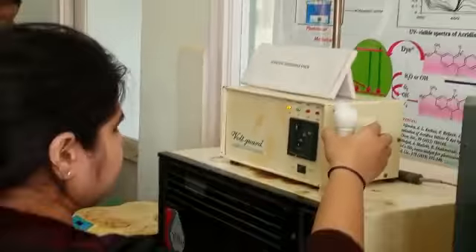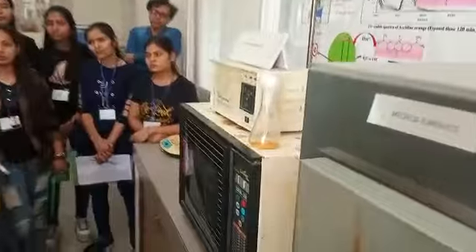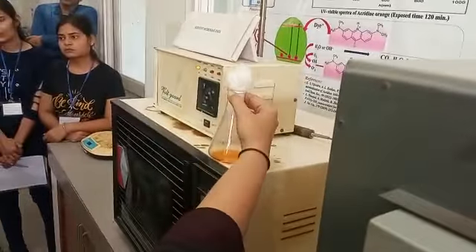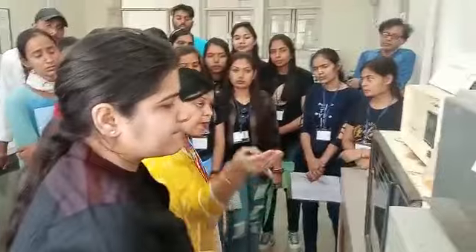दिख रहा है आपको? व्हाइट किए थे हमने and color is changed. You can observe that now your reaction is completed. But how can we check this by TLC? You have to put the spots of reactant. With this you have to put the spot of your product. Understood? इसके बाद क्या करेंगे बच्चों?